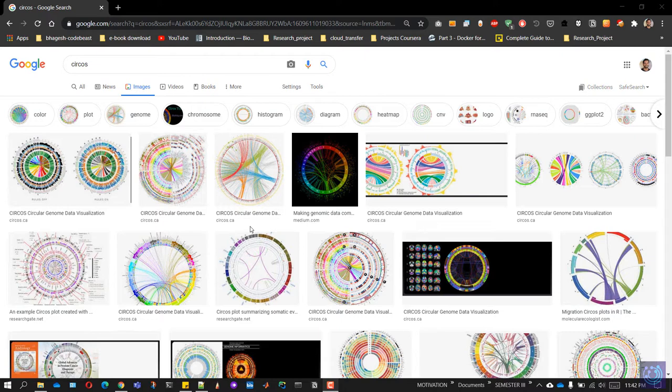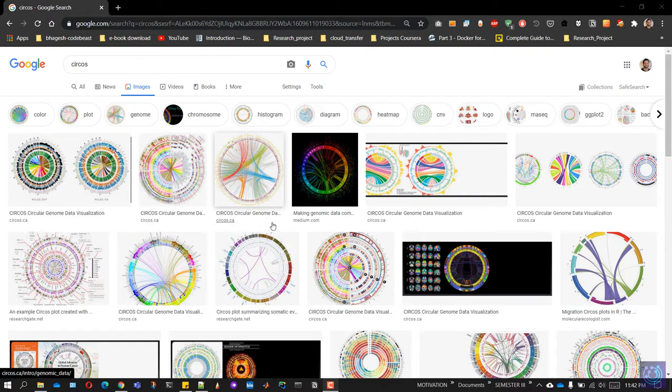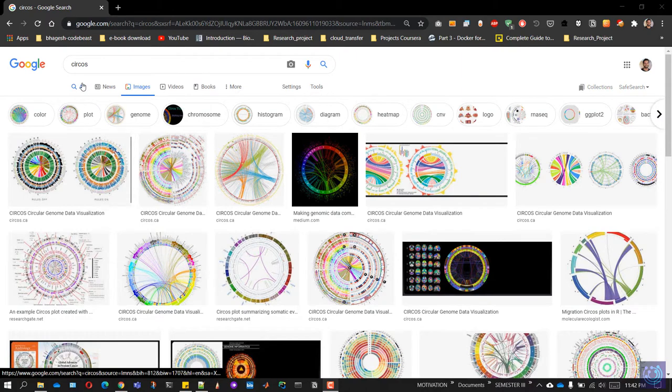Circos is actually a Perl-based tool to construct circular plots such as the ones you can see here. These plots can be constructed using genomic data and various other types of data. So let's just dive into how to install Circos on Windows.